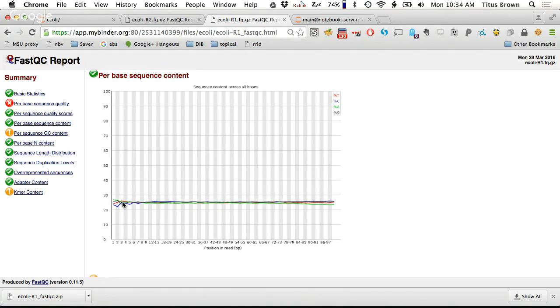And you'll see a little bit at the beginning, and it often comes from bias, like ligation bias, in terms of which of your random fragments is being ligated to your sequencing adapters. But it's pretty even. I'll show you in the RNA-seq, you'll see much bigger variability here.